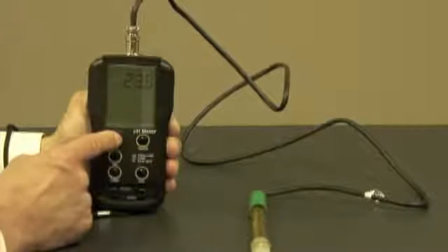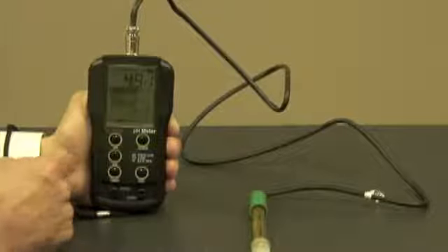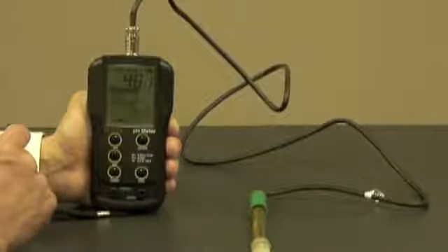And when I'm ready to calibrate, I hit the pH button and go right into the calibration mode. An awesome feature about this meter is the fact that you have on-screen instructions for calibrating the probe.